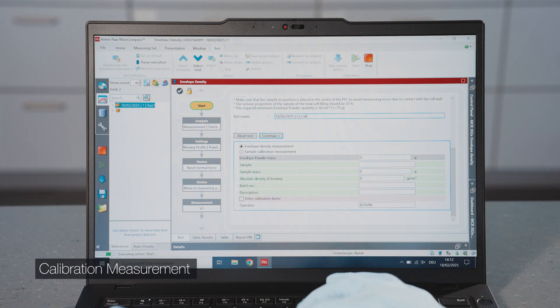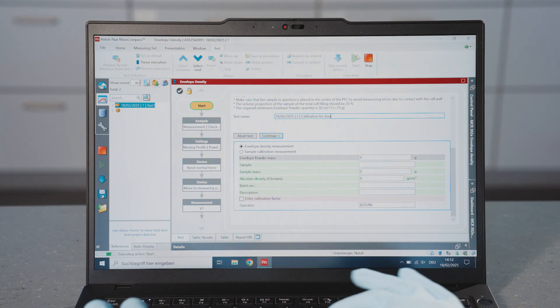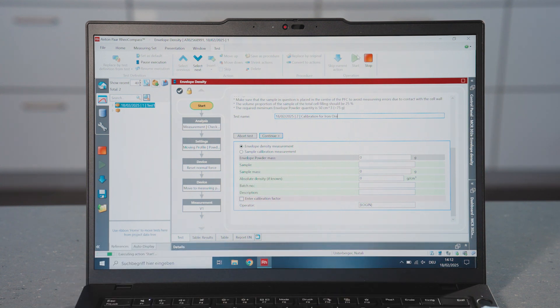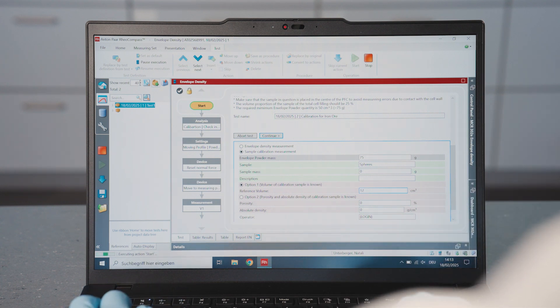Select Calibration Measurement to calculate the calibration factor for a specific sample type. The calibration factor is used for detailed detection of sample irregularities. In addition to the standard inputs, enter the known volume or the absolute density and porosity of the calibration sample.